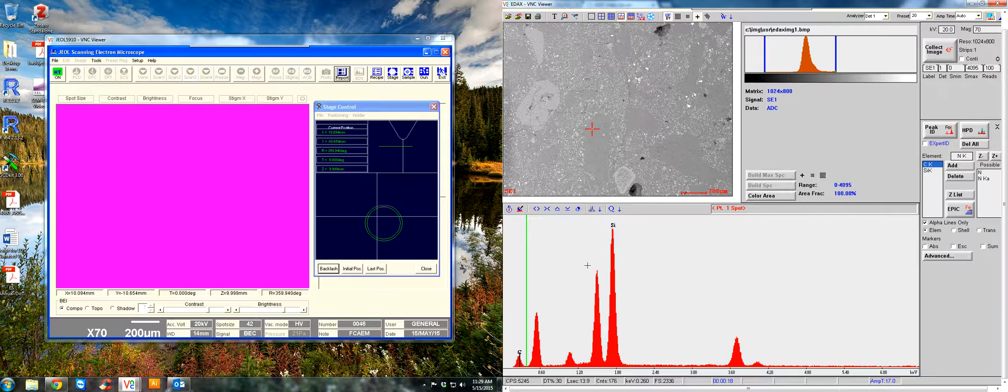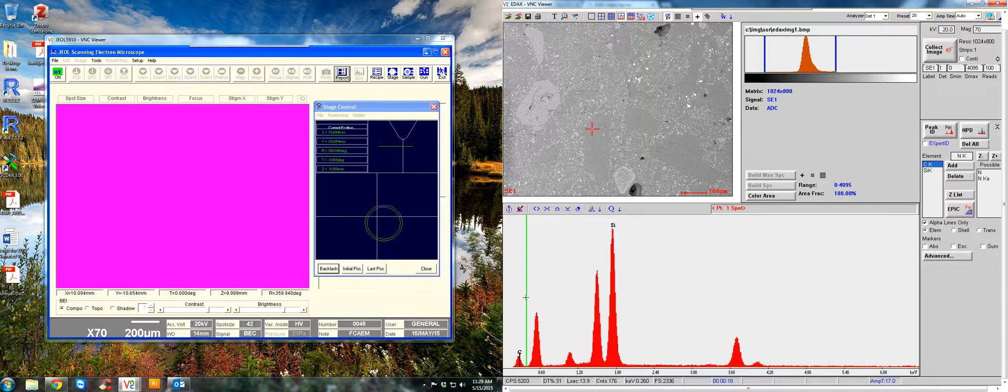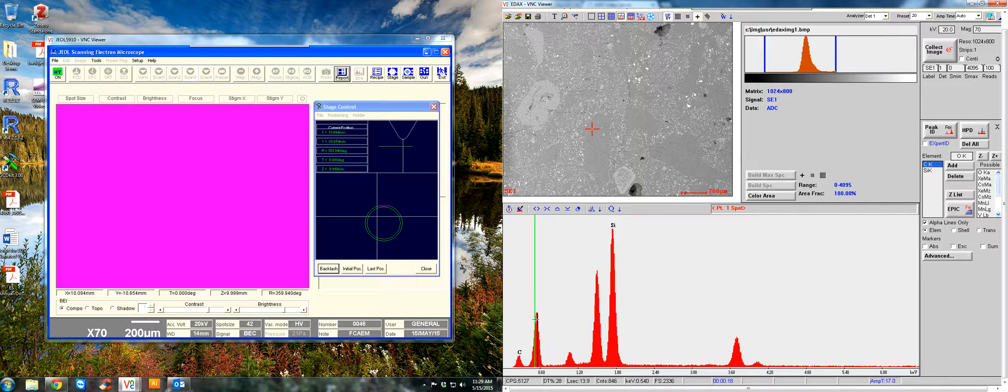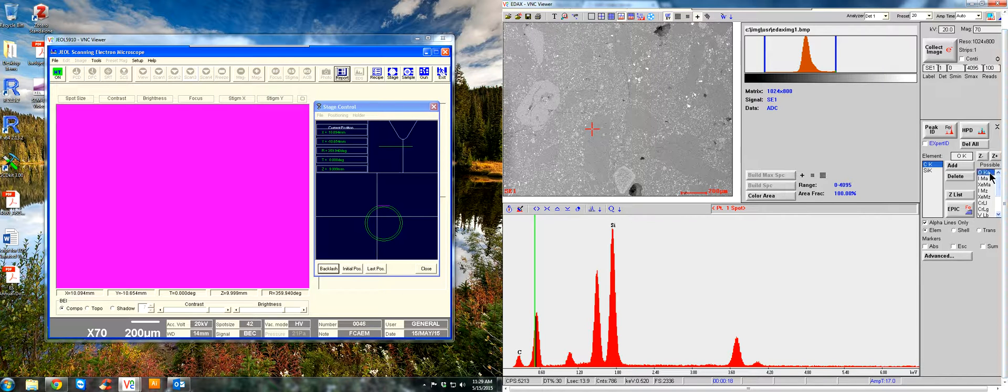And then on the graph, it will show you where nitrogen's energy line would be or its peak, but it's not there. So we can go to the next one. There's oxygen. So that's what this peak right here most likely is. It's an oxygen K-alpha peak. So we can add that.